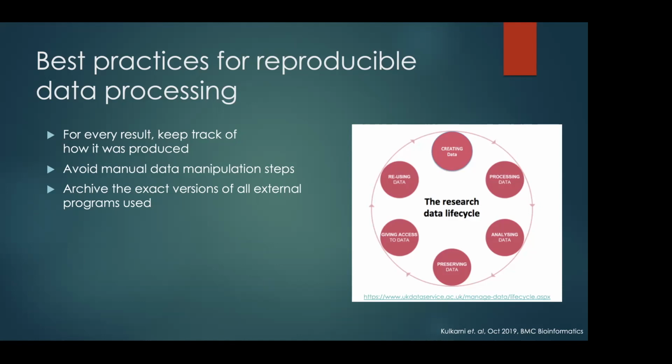Those are becoming very cumbersome, because when you install one program, another program gives an error that, okay, hey, this program is not working with that program anymore, or something like that. So it's crazy. That's why when you do something, it means that it worked, that you have to get a snapshot of what worked, and then it will work forever.